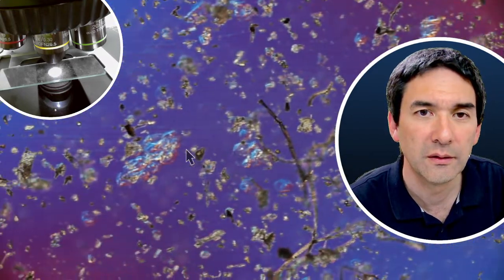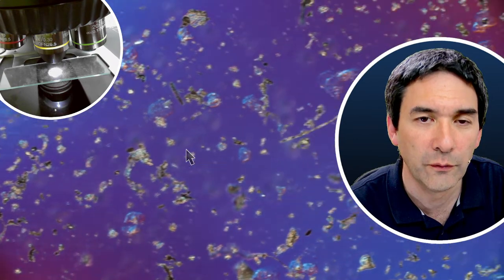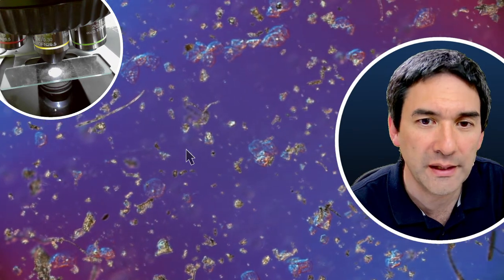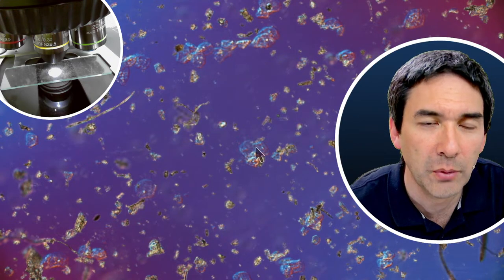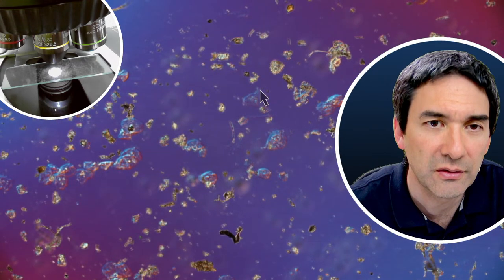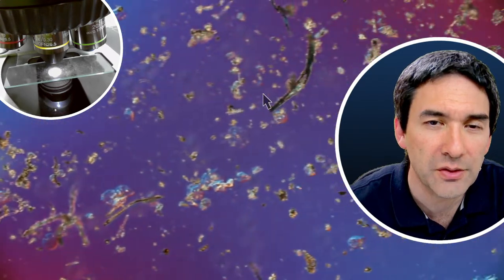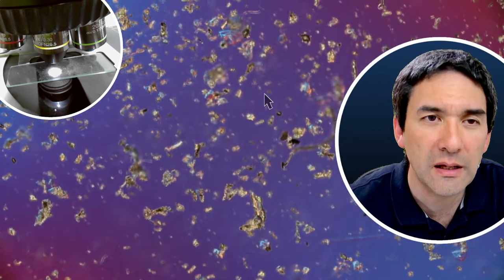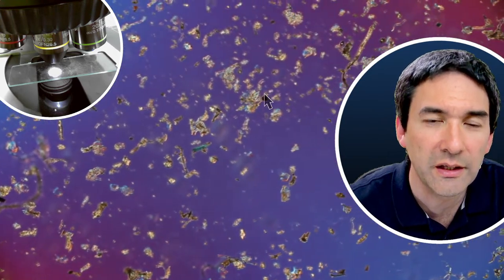So we see that, and then you can go for some observation and try to find, for example, these flat structures that you see over here, most likely skin cells. Skin is very, very common in house dust. Lots of fibers again. Today, when I looked at it, I did also find some butterfly scales and other interesting things.